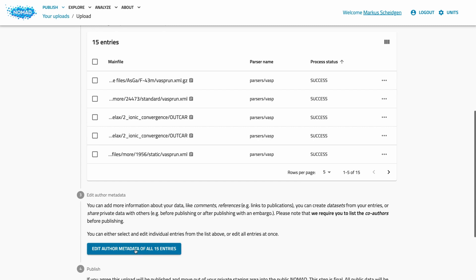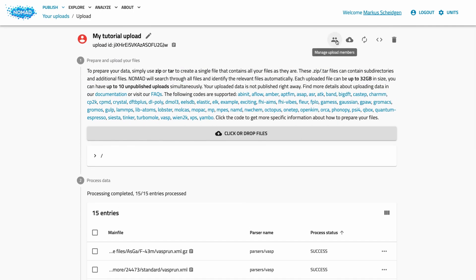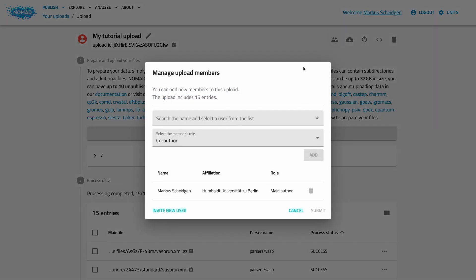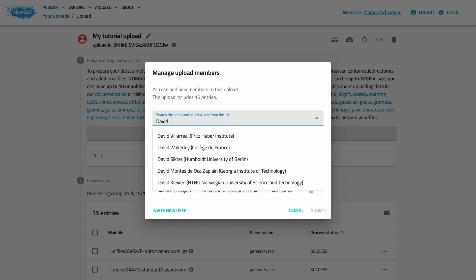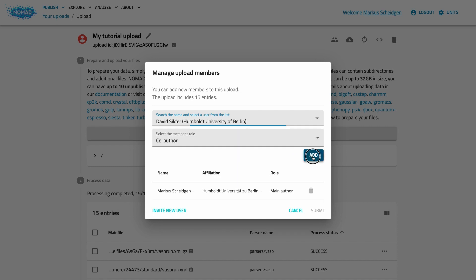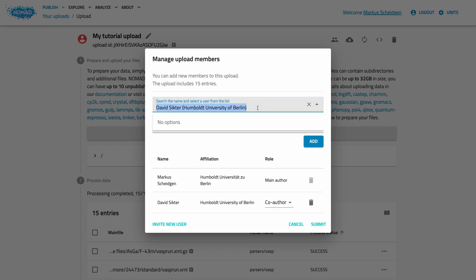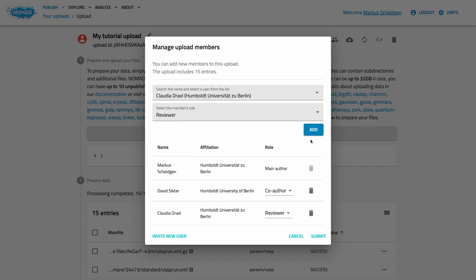The next step in preparing an upload for publication is adding more metadata. Until now we uploaded files and let the parsers do all the work, but we also allow you to add additional metadata. These are things like comments, references to online resources and datasets. Metadata also includes your co-authors — this is especially important and we request that you truthfully list all involved people; the same norms as for paper publications should be applied. This button opens a dialogue that allows you to control who can contribute to your data and who is allowed to review it, even if it's not yet published. You can search and add any NOMAD user to be either a co-author or a reviewer. You can also invite new users to add people even though they might not yet have an account. All co-authors, including you as the main author, will be listed as authors of your entries. Reviewers are not mentioned publicly, but this upload will appear in their uploads list.